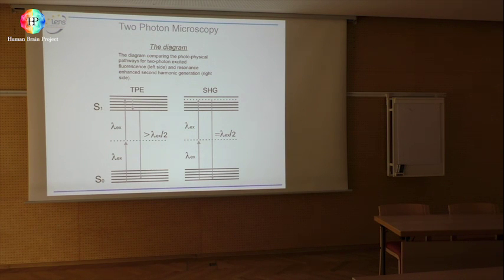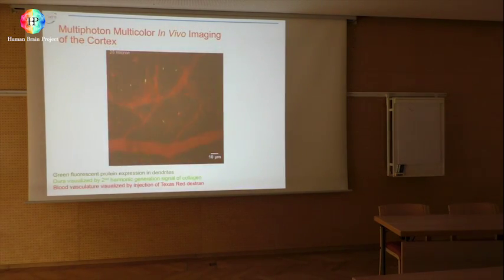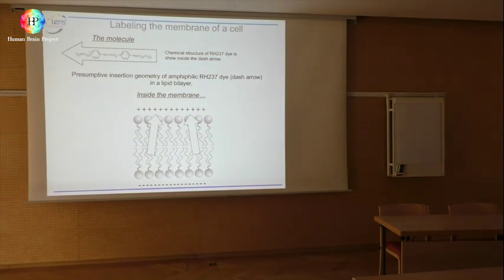Okay? Now, those emitters of 2 frequencies are like small antenna. Okay? So, if you see here, suppose one is an emitter of second harmonic. It's a molecule that emits second harmonic. And this molecule goes into the membrane of the neuron, so it has a hydrophobic and a hydrophilic part.